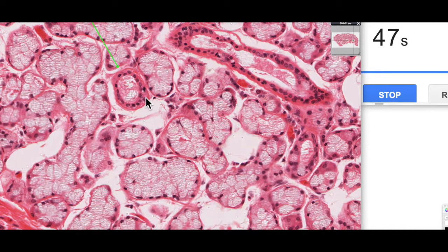So this is, again, a typical place where we find simple cuboidal epithelium in a duct of an exocrine gland. One of these early ducts leading away from the secretory acinus, forming what's known as an intercalated duct, eventually leading to a structure called a striated duct. So those are a couple of examples of simple cuboidal epithelium.